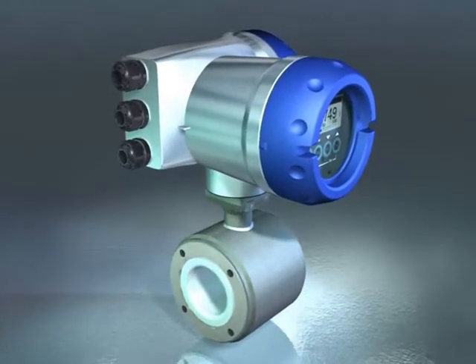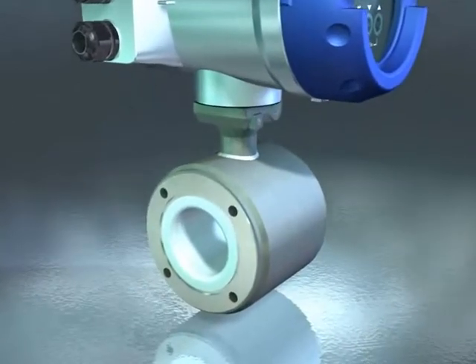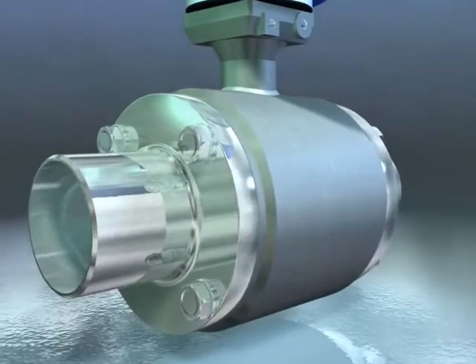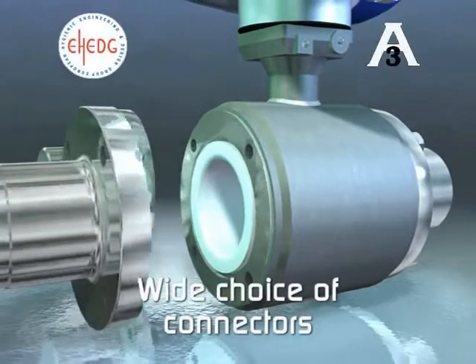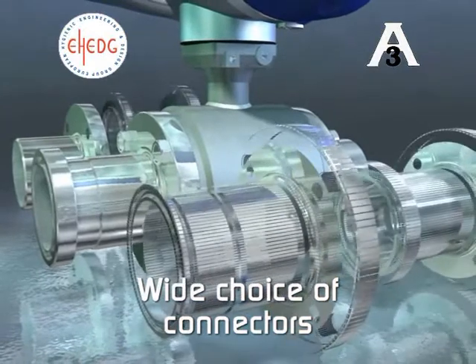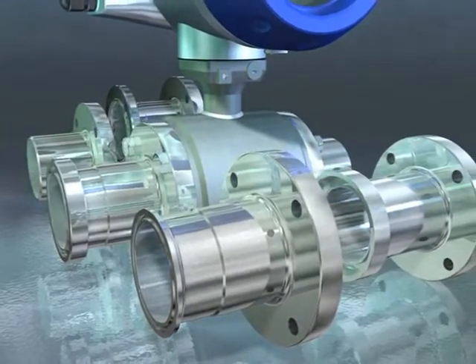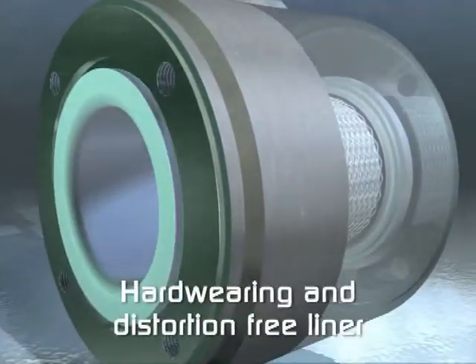This ingenious, simple and highly desirable solution makes the Optiflux 6000 ideal for all hygienic applications. The new Optiflux 6000 has a standardized body that takes a very wide range of different connectors. By using the same body construction, the behavior of the meter is known exactly, so the results are consistently accurate. Optiflux 6000 offers true Krona performance.